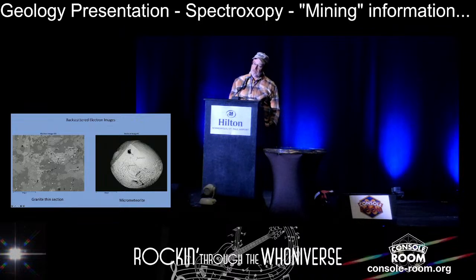The other type of imaging that we use is backscattered electrons. What I didn't mention, secondary electrons are surface electrons that get kicked out by the high energy electron beam, and it's the quantity of electrons that make it to the detector. Well, if there's topography, things on a side pointing away from the detector will not produce as many electrons as they make it. And so we see those differences in this grayscale. What we have to remember, it's not a picture, it's actually a signal. So it's the sum total of signal that we're measuring across the sample.